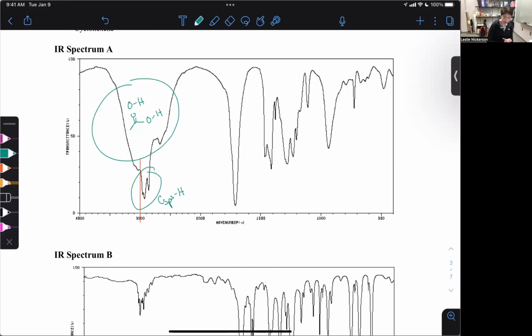All right, so that's telling me that I might be on the lookout for some sort of benzene or alkene, but I actually don't think so, just because this looks like it's going to be the one OH peak, and then on the side over here, I've got my sp3. But that's not to say that buried under here somewhere there's not some sp2 carbon H's, but there's no way for us to see that at this point.